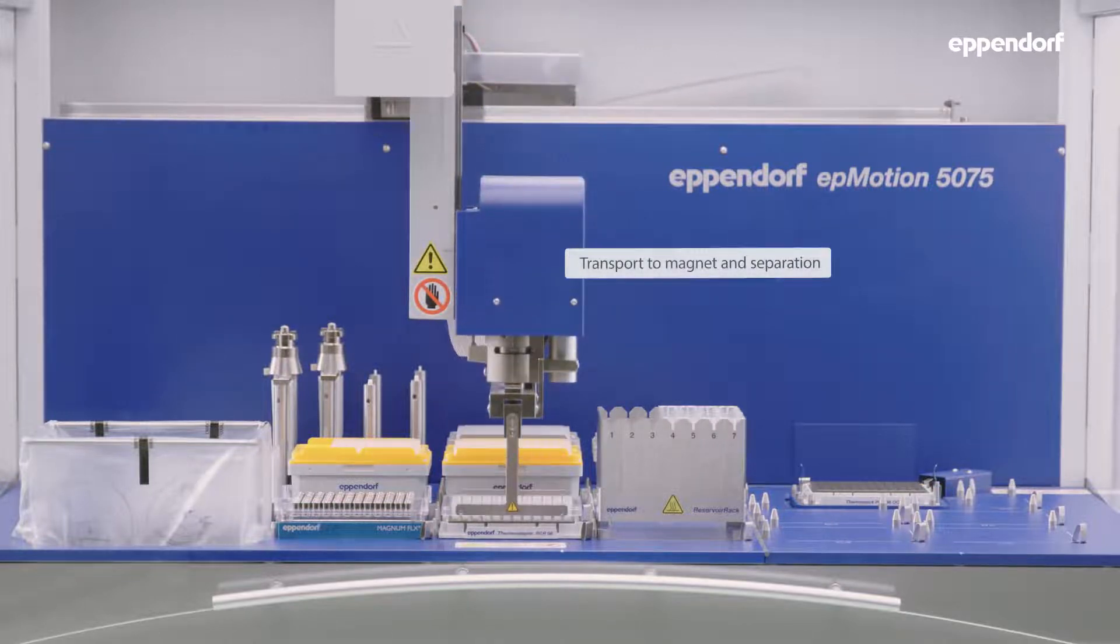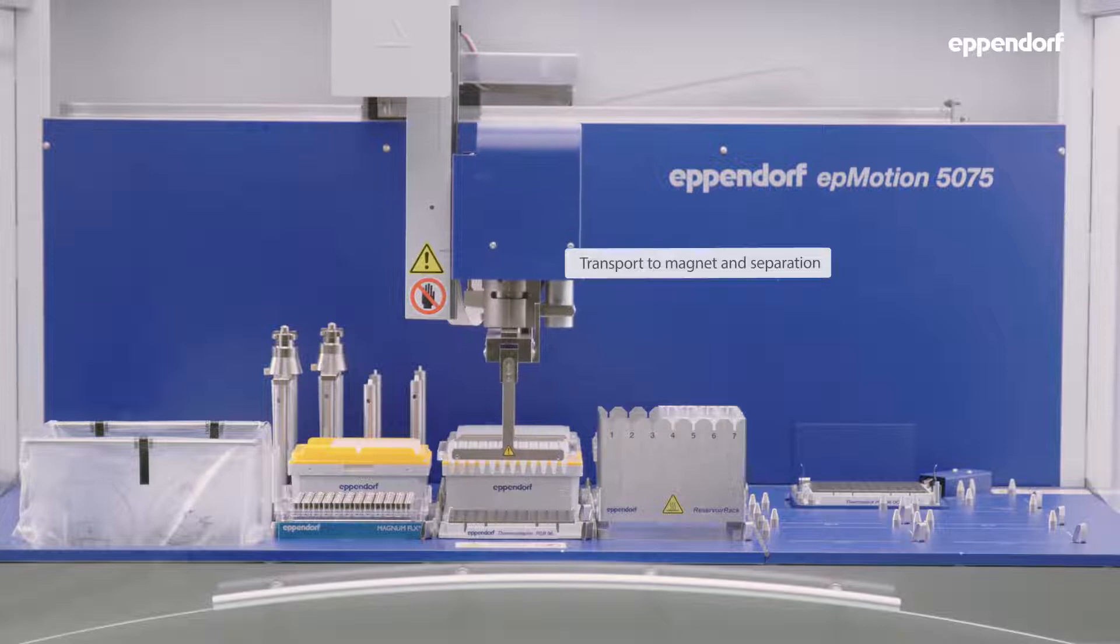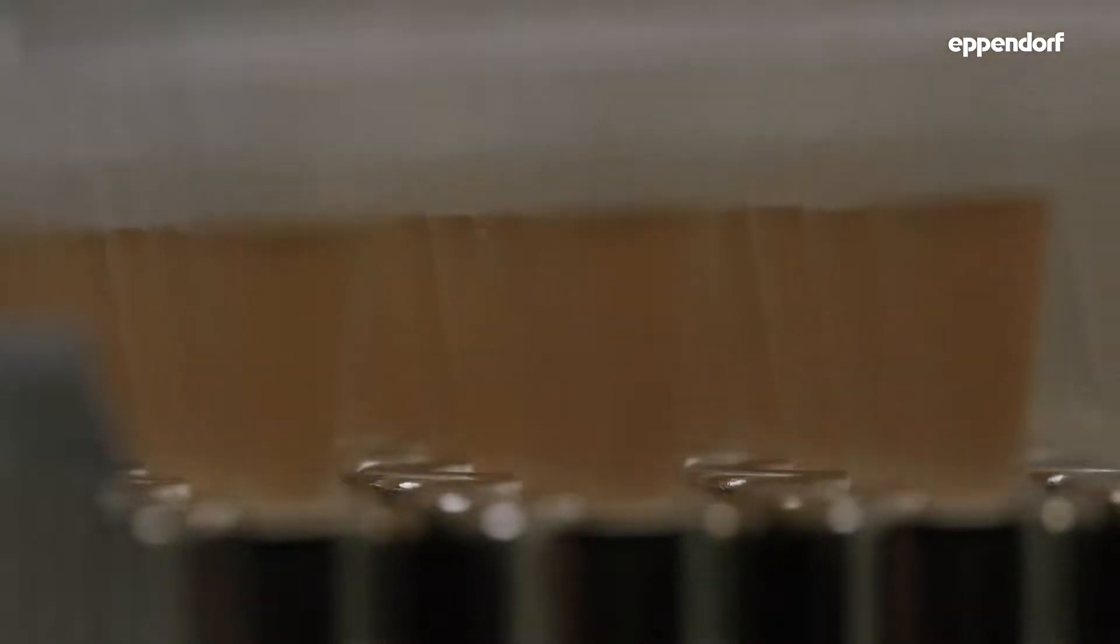For the following bead washing steps, the sample plate is moved onto the magnet plate using the gripper tool. Nucleic acids bound to the magnetic beads get separated from the supernatant on the magnet.